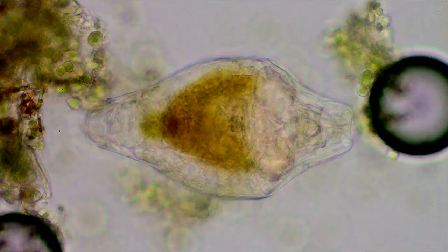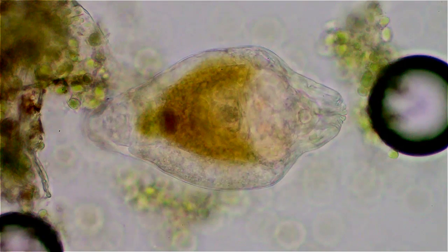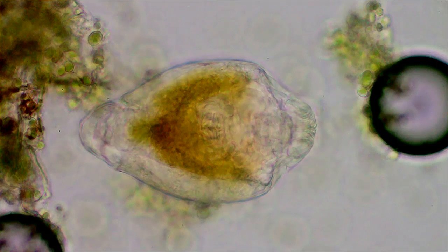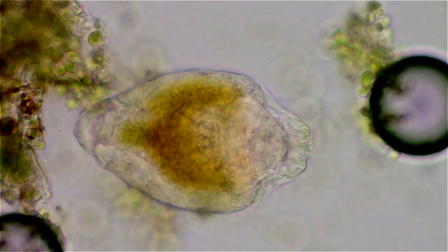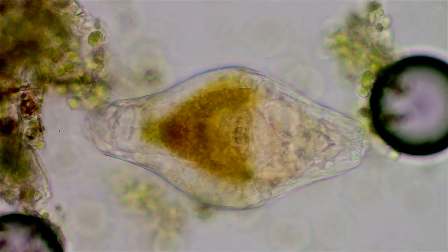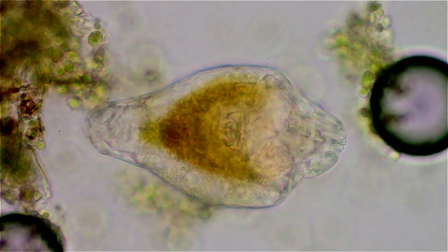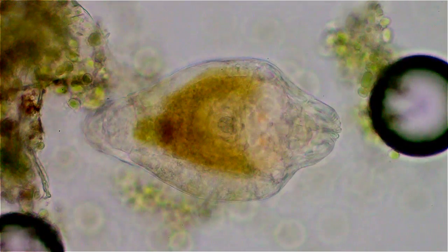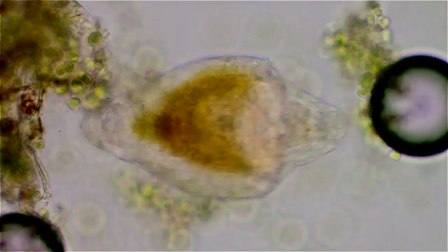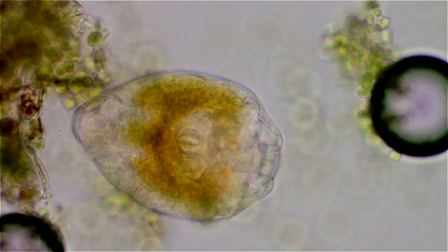This is a rotifer cyst — I believe it's a Philodyna, and I'm almost positive it's a cyst rather than an egg, since you can see the mastax inside there. Just at the top edge of the golden area, there are her two eyes. I think she's just in the process of waking up.